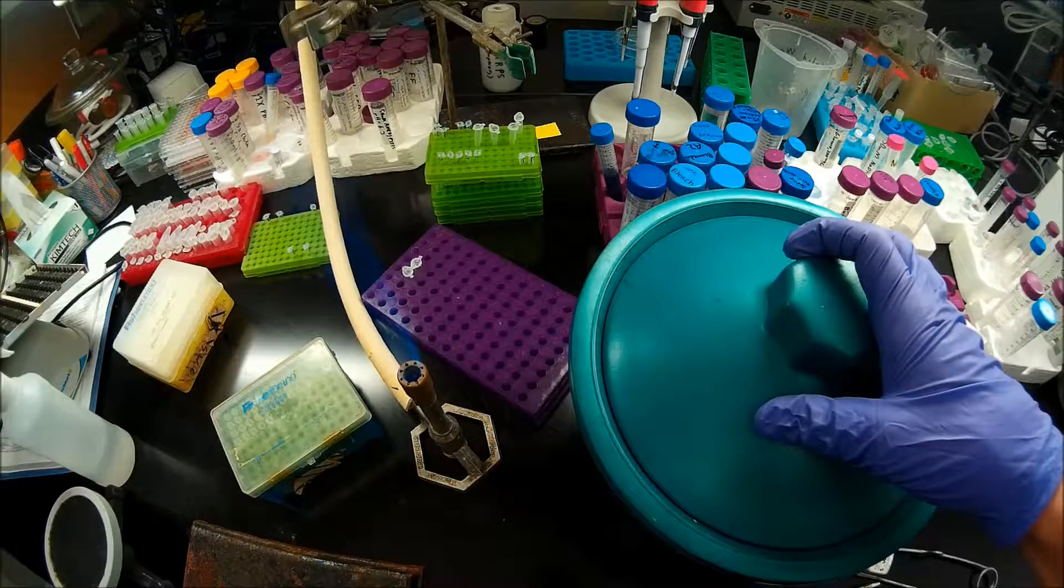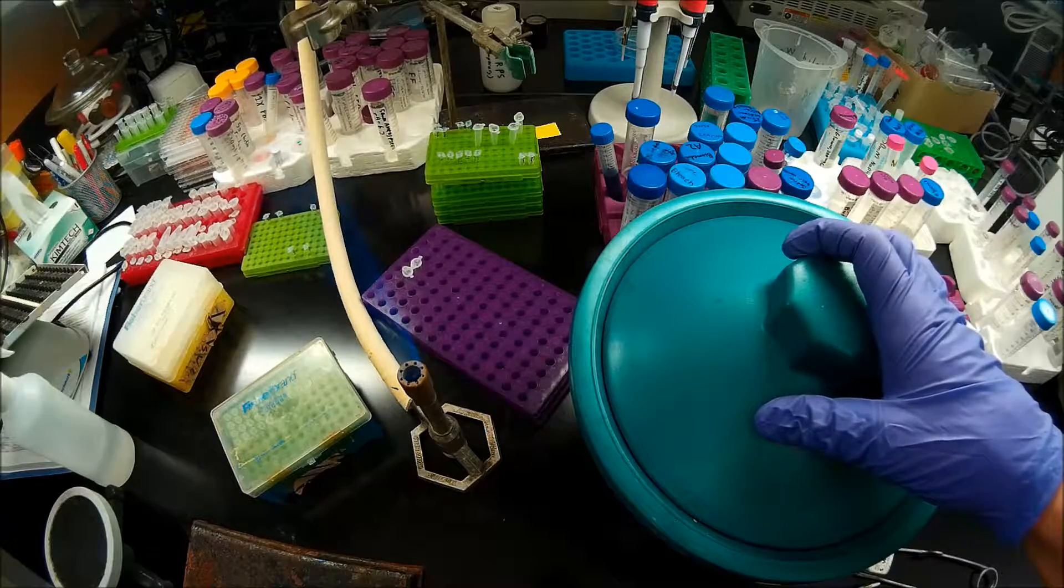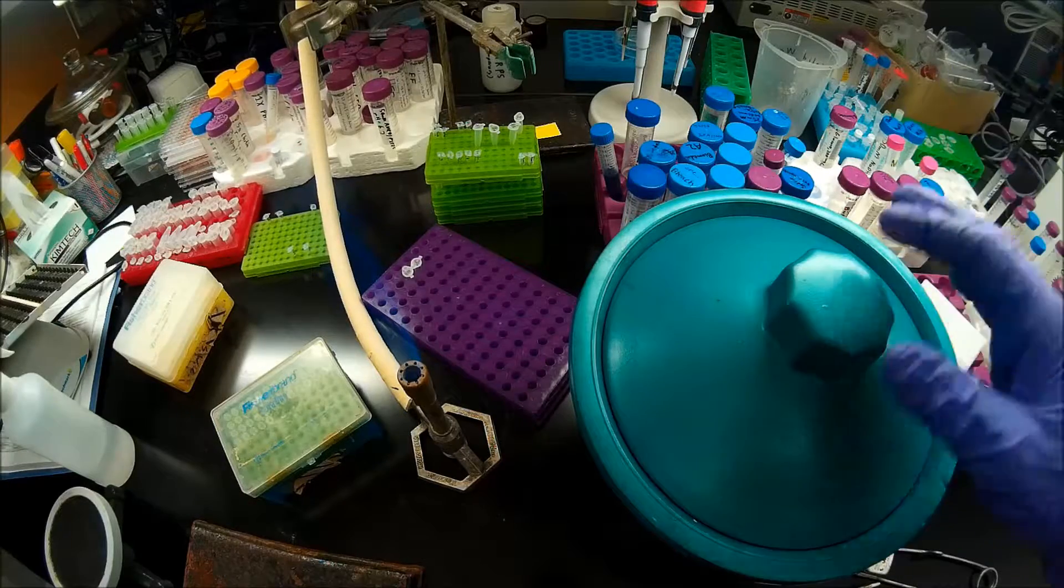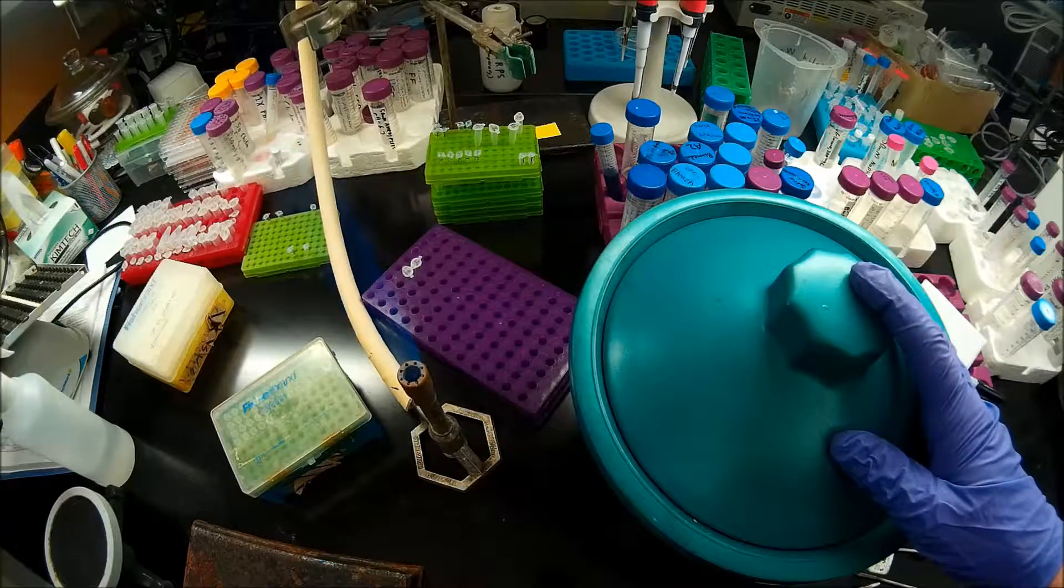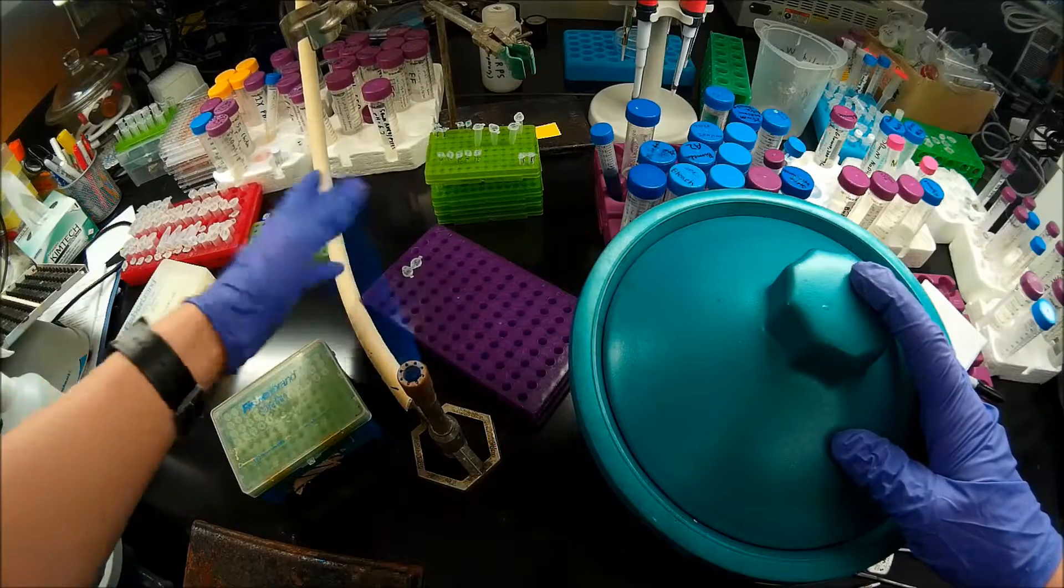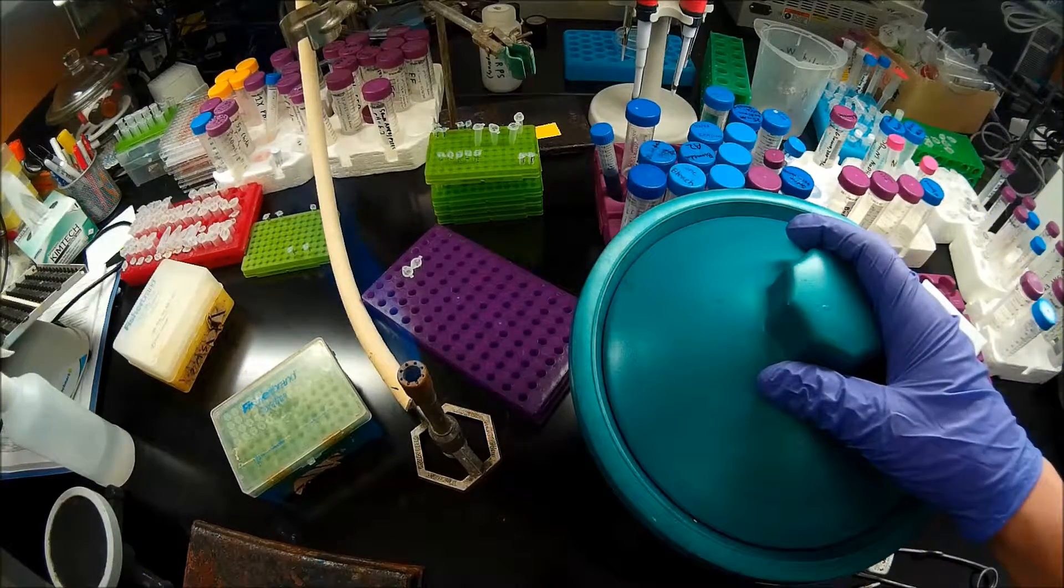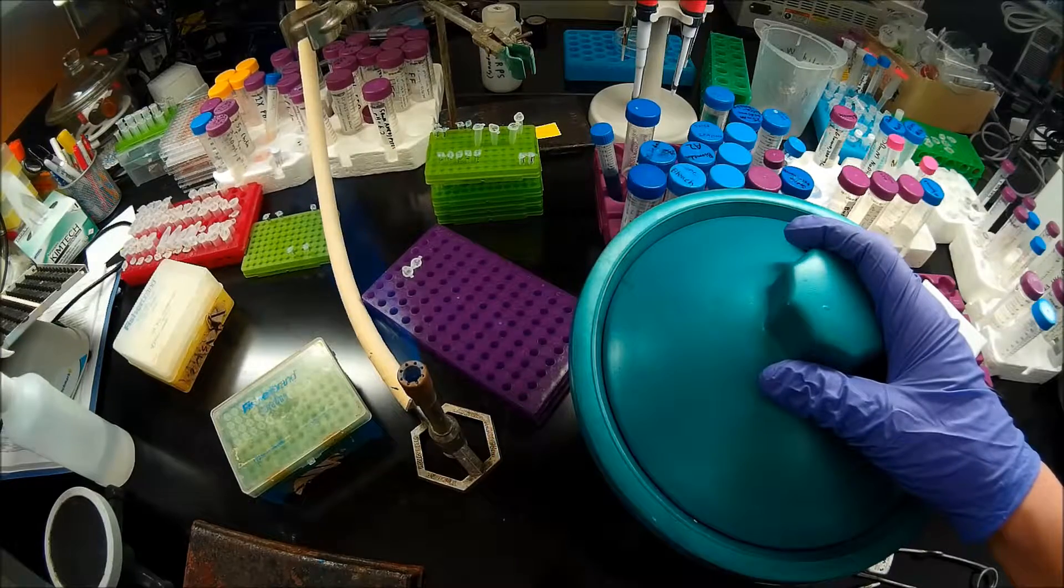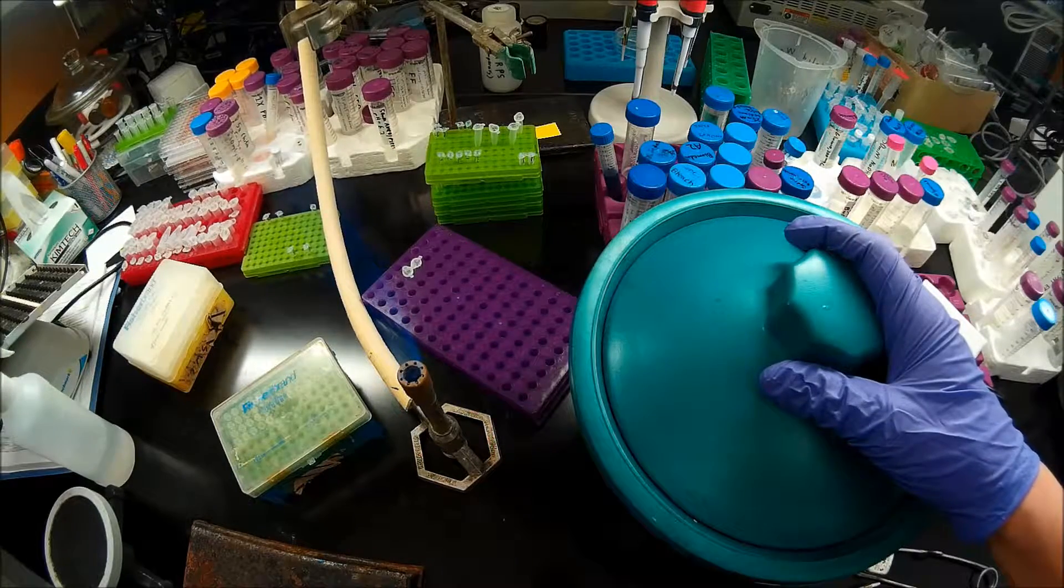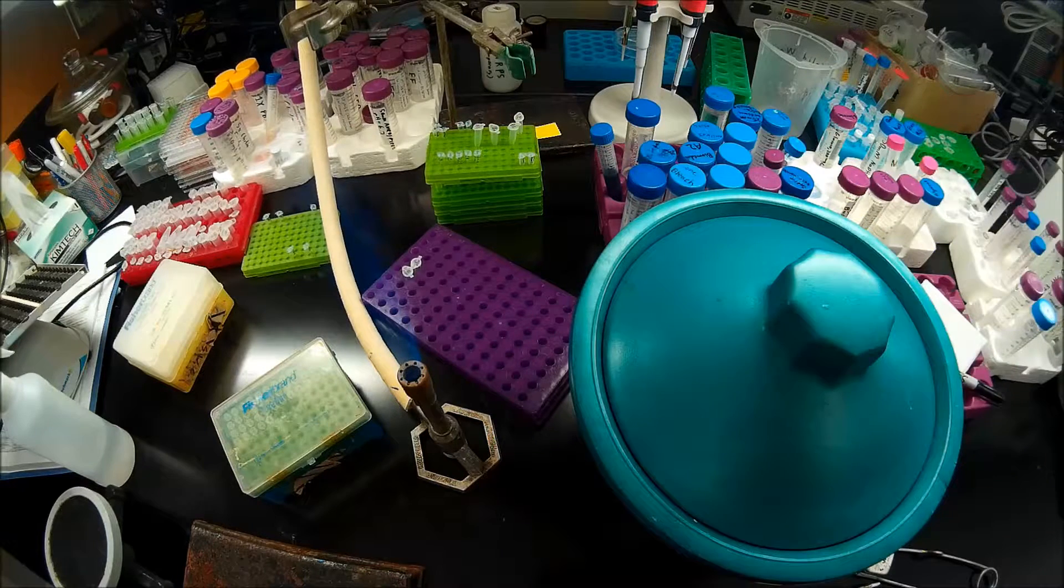So if you were transforming with whole plasmid from an average mini prep, about 100 nanograms per microliter, and you used 5 microliters of your whole plasmid, you would get an outrageous number of colonies. So you'll want to calculate how much DNA you use based on the transformation efficiency of your cells and the concentration of your DNA samples.